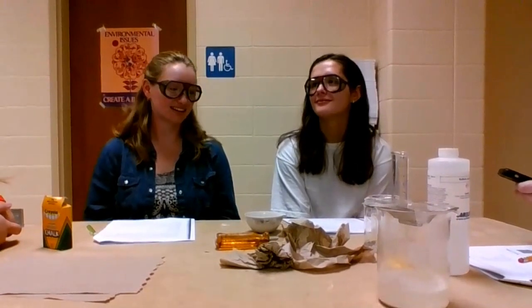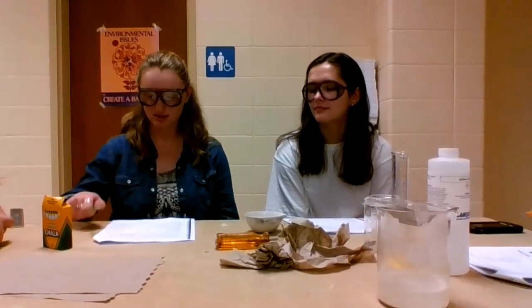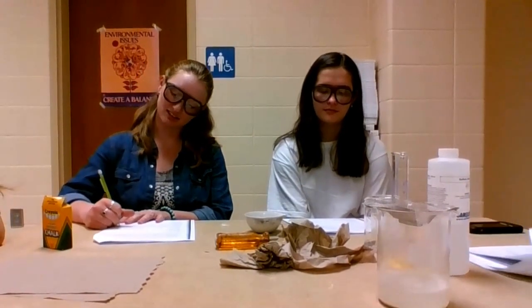I mean, it's pretty obvious what's happening, right? Nothing happened to the zinc. But something bubbled. Yeah, and what else? It's kind of disappearing until you get to the end. It dissolves. Those bubbles just kind of disappear.